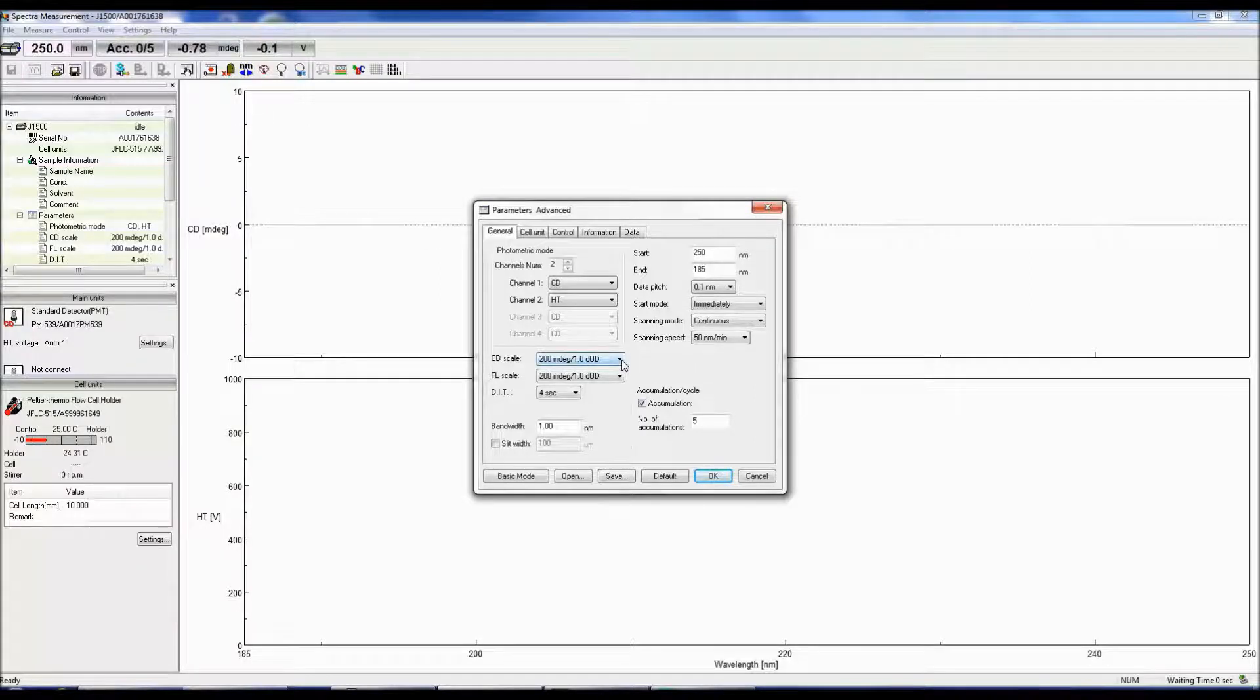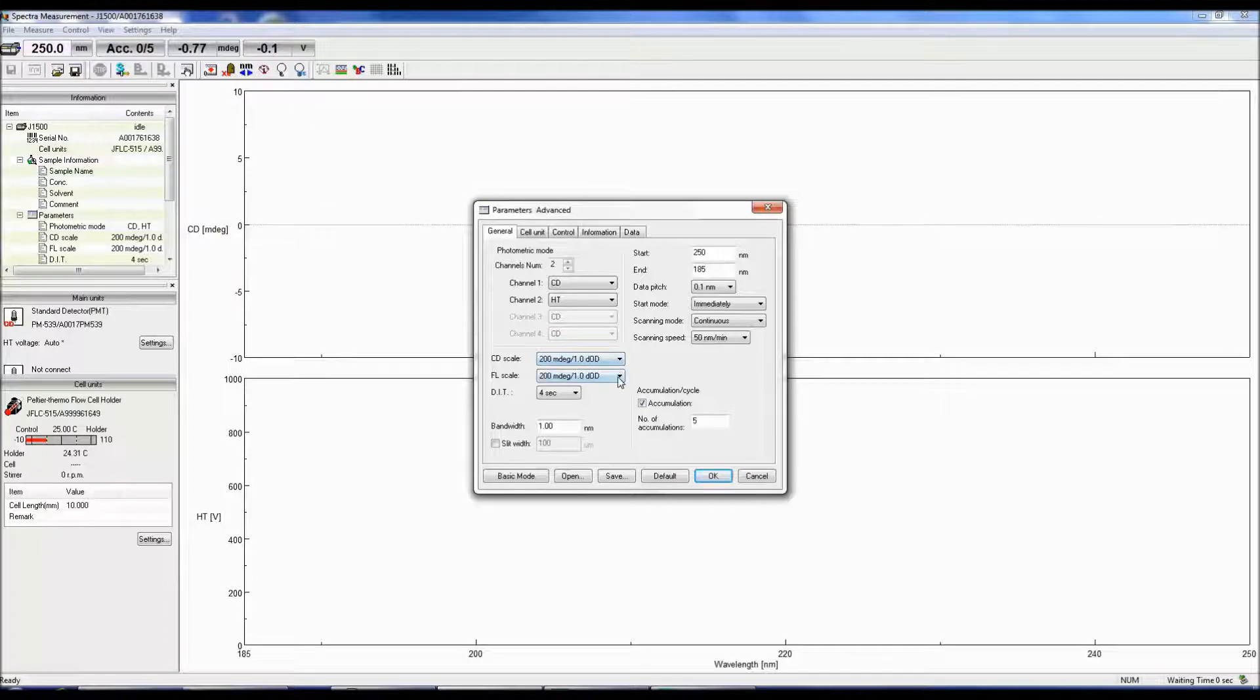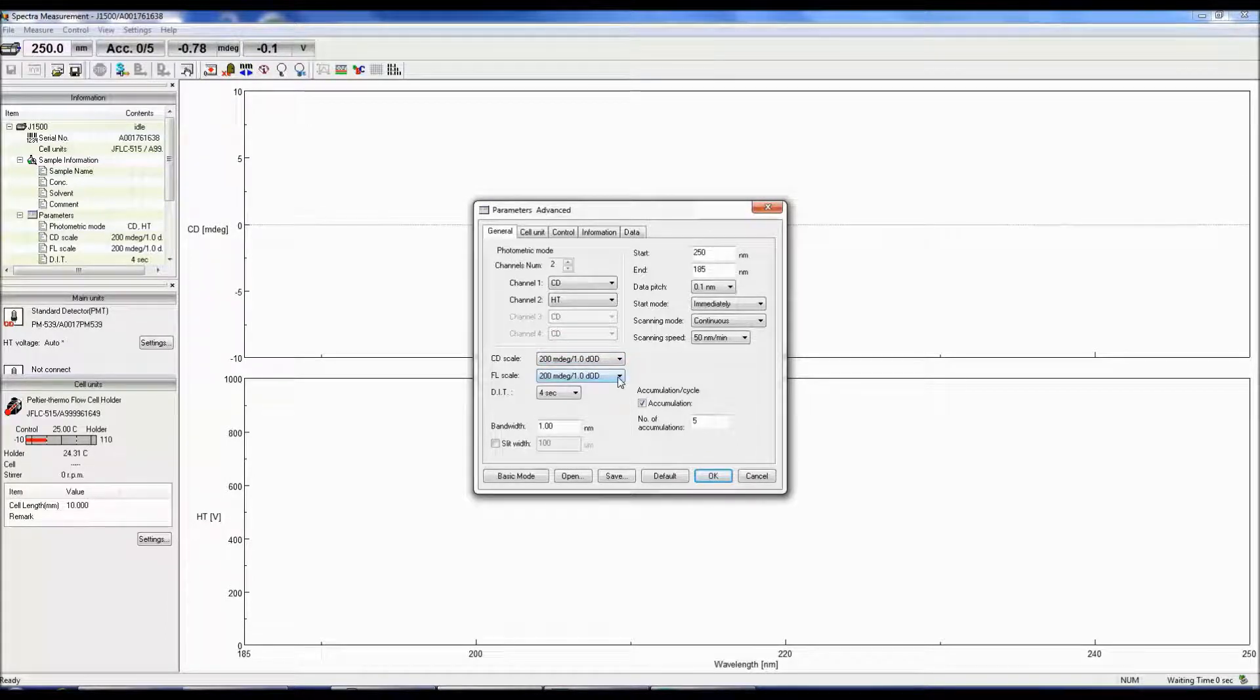The CD scale is the limit at which a CD signal can be obtained, and the fluorescence scale is the limit at which a fluorescence signal can be obtained.